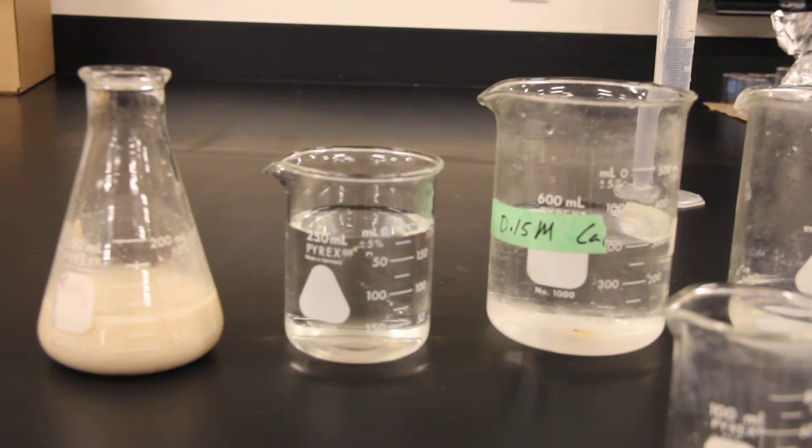If you put the yeast into a solution that contains peroxide, the catalase will break down the peroxide and make little bubbles on these yeast spheres. If there are enough bubbles, they'll become buoyant and float to the top of a column of hydrogen peroxide. That will be the way we indirectly measure catalase activity by the time it takes for these yeast spheres to rise.